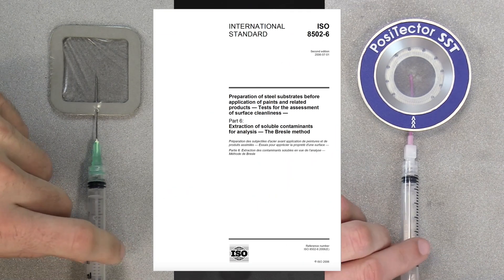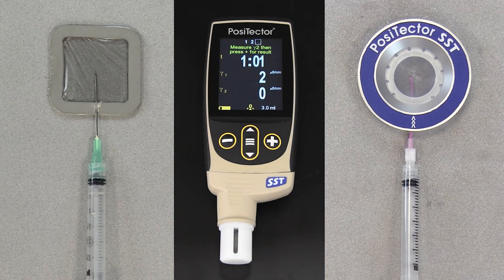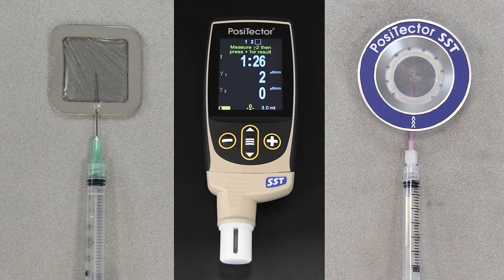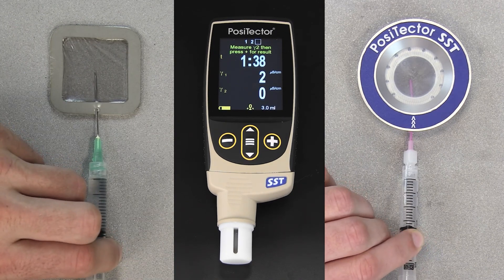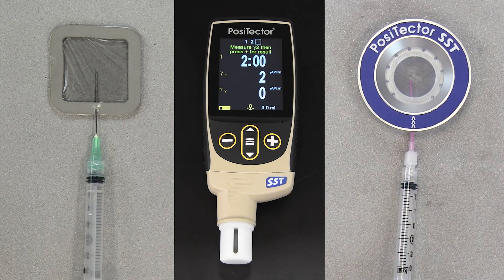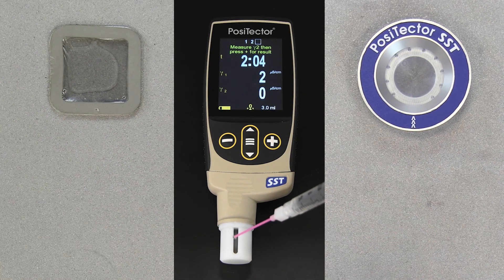ISO 8502-6 recommends this process be repeated at least four times. The test time should be agreed upon between the interested parties. DeFelsko recommends a two-minute test time. After the desired amount of time has elapsed, withdraw the water from the test patch. To complete the measurement, inject the water into the test cell of the PosiTector SST. Allow the reading to stabilize and press the plus button.